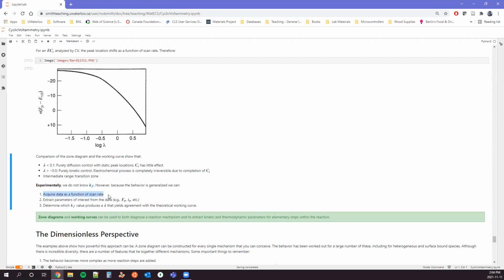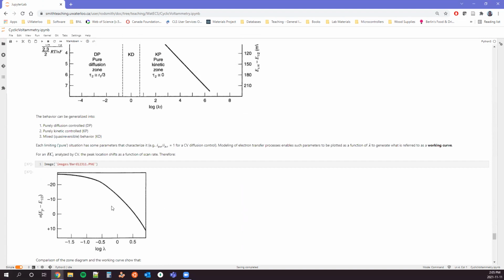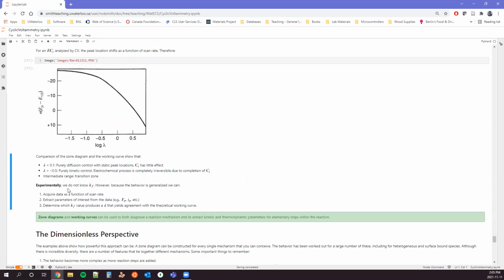And so what we would do is acquire our scan rate dependent data, right? A whole bunch of cyclic voltammograms at different scan rates. We would then analyze each of those to extract whichever parameters we find interesting, right? Maybe the peak, maybe the charge under a curve, maybe the shape of the peak. And then what we can do is plot those parameters as our y-axis, and we can adjust, right? So lambda, if we go back and look at it, we're controlling our scan rate. If we're looking at, let's say, the irreversible, we're controlling our scan rate. What we have to do is vary kf, right? We vary kf until our curves overlap with these working curves, with these theoretical data. And that gives us a measure of what our kf value likely is in our solution, right? And so it gives us a direct way of pulling out rate constants.